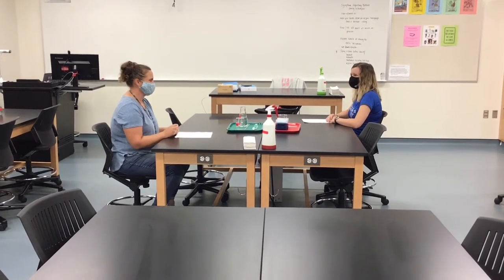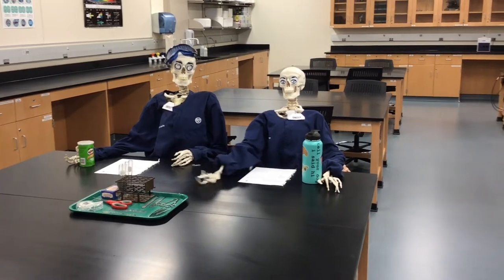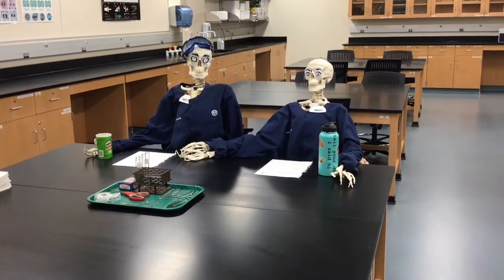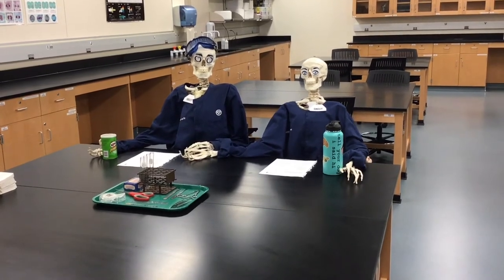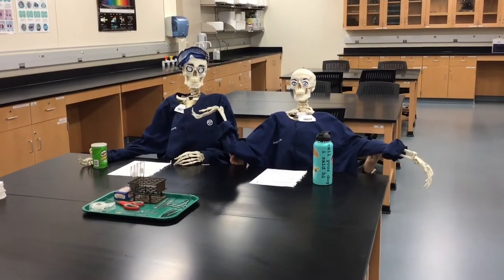Your professor will give you instructions on how to begin. As you can see, Skelly and Shelly are not following directions. Not only are they not wearing their masks in the lab, but they have food and drinks and are sitting much too close to one another. Please don't be like Skelly and Shelly.